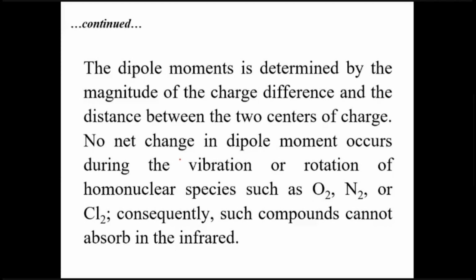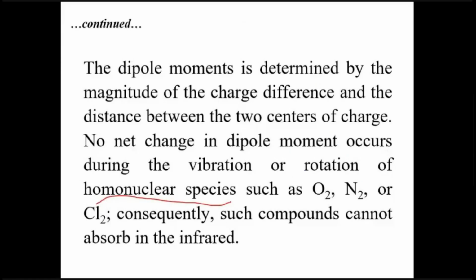No net rotation of homonuclear species because the charge on both of them is same. So there is no net charge difference like O2, N2, Cl2. Consequently, such compounds cannot absorb infrared radiation.